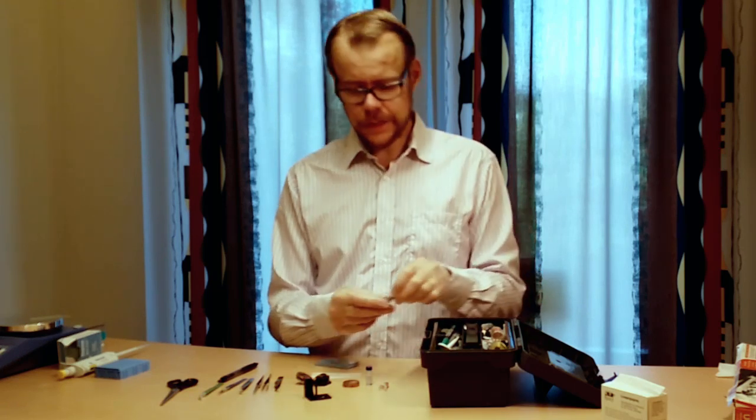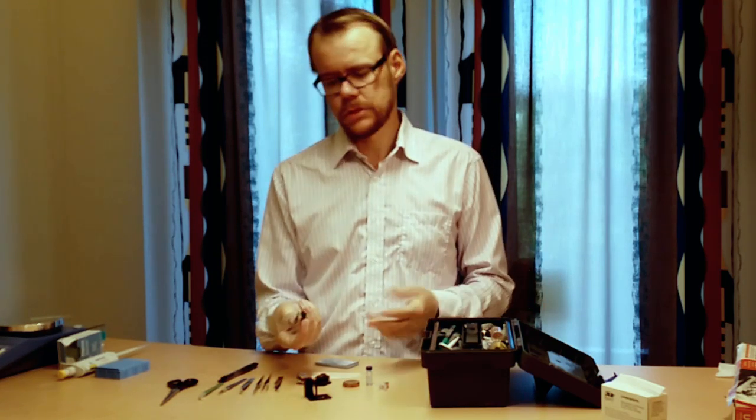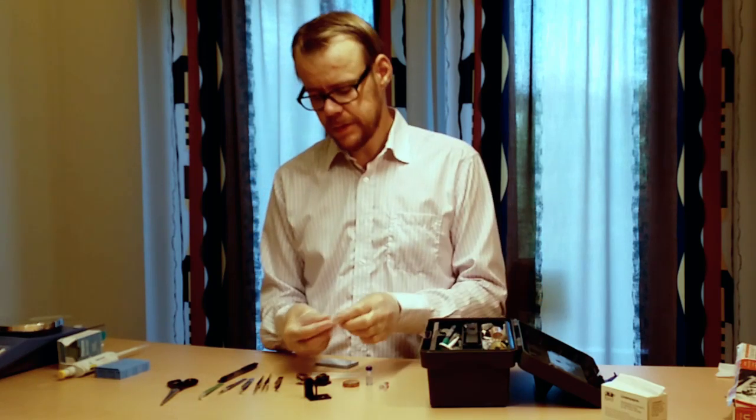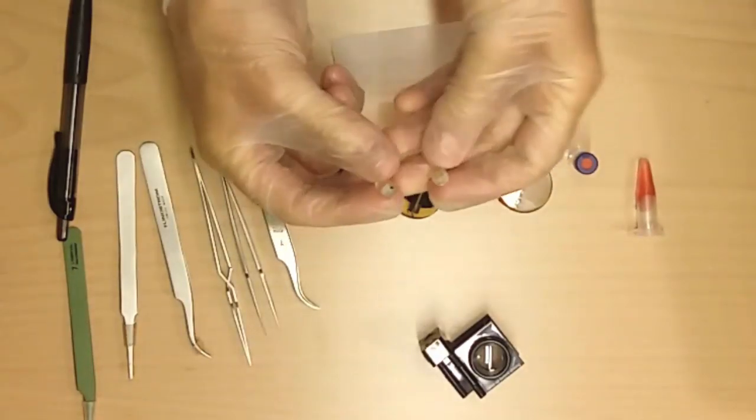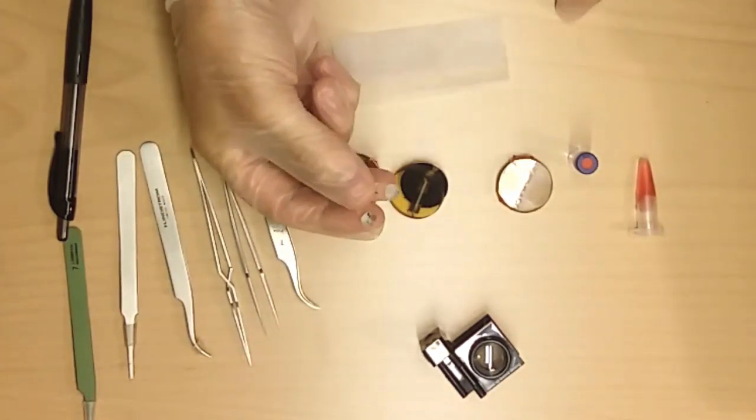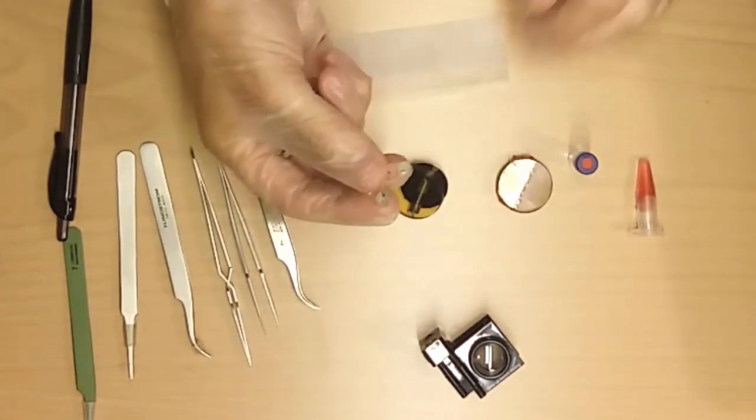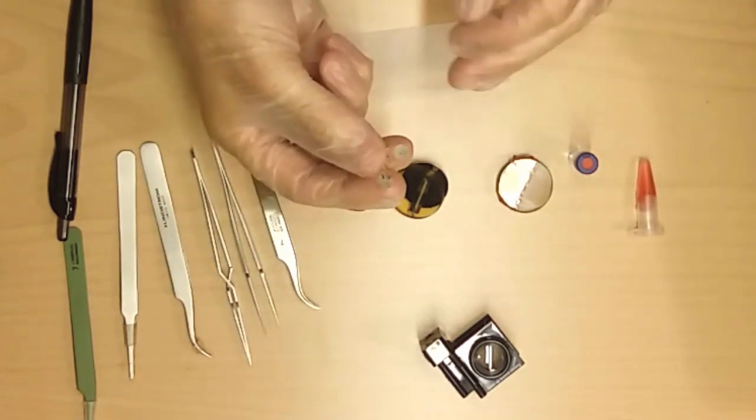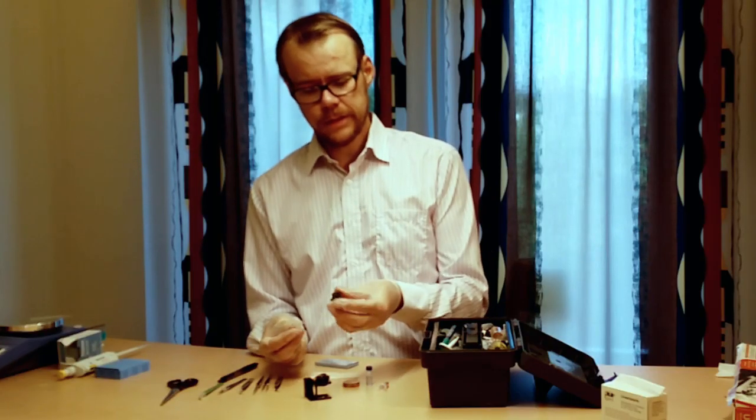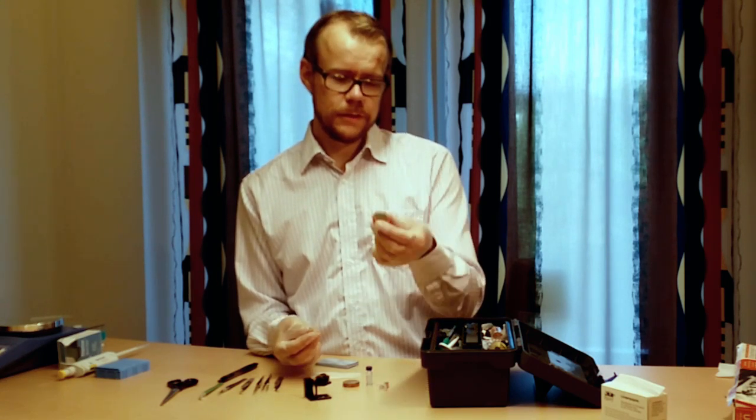I also have different kind of polishing paste of different grades. Some glass knives when you do microtoming. This is a different kind of embedding. Here I am embedding the plastic into these small cylinders instead. And this is used when you do ultramicrotoming. You cut slices of the paper. And that you need to do when you do transmission electron microscopy on the samples. Because you need the very thin slice. I mean if you do scanning electron microscopy thickness is no problem. You want to study the surface. So then you can go with this.